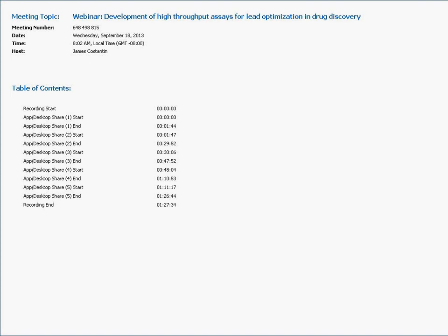Next, we can look at some pharmacology. So if we look at the IC50 values determined on the IonFlux, as well as the IC50 values published in literature, we can see that there is close agreement with almost all being within the accepted twofold agreement.